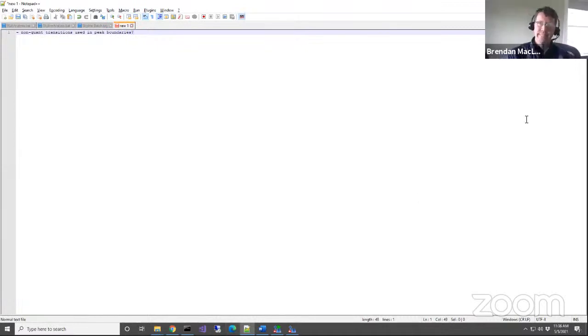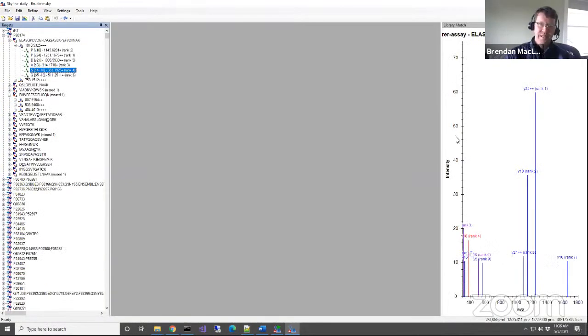All right, so I mean, Nick's a pretty smart guy, but there's clearly a bunch of different places in the code where we use chromatograms, and so that's a good question.